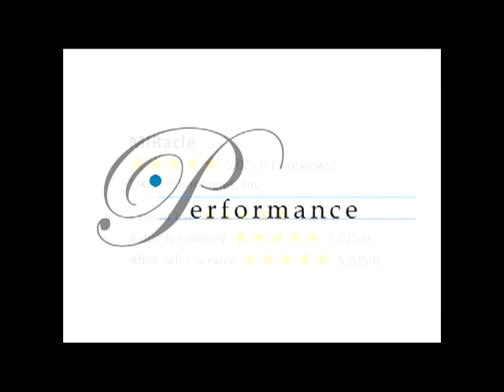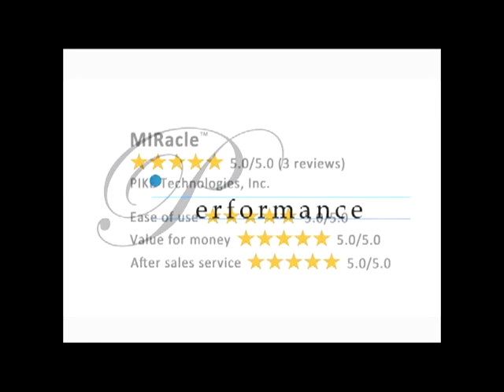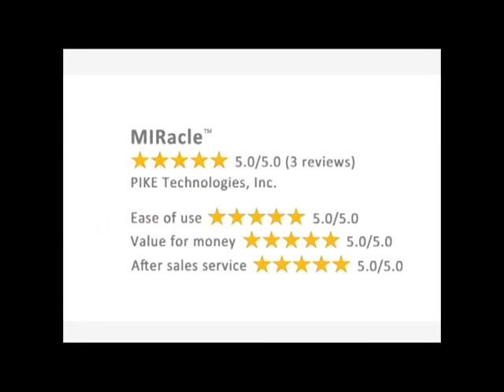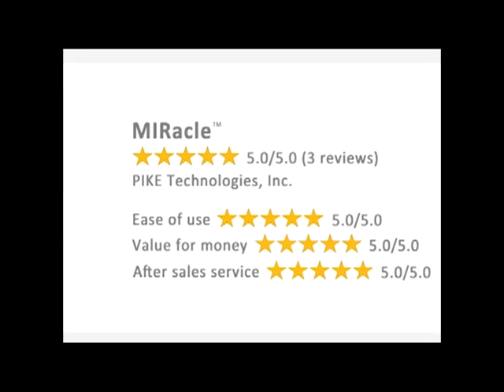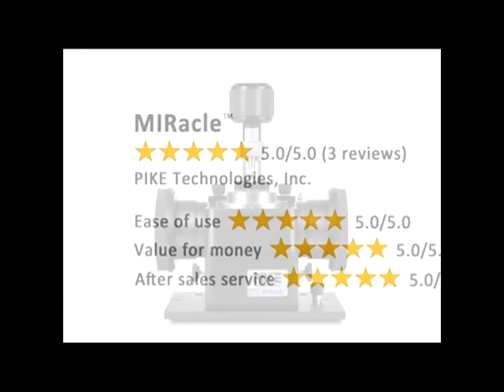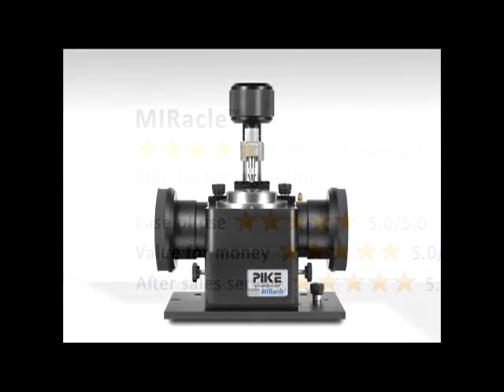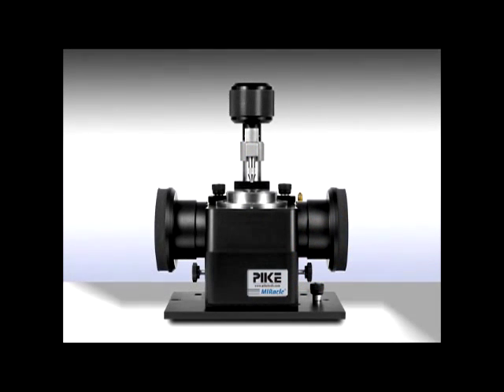The MIRacle has been recognized for its outstanding performance and ease of use. Its power may be found within its innovative optical design.